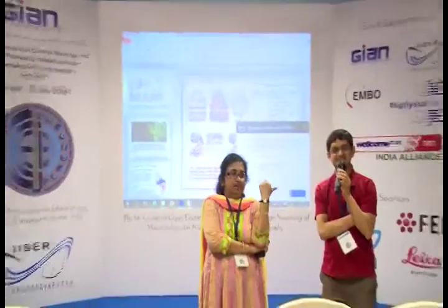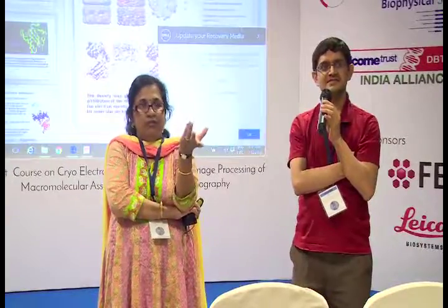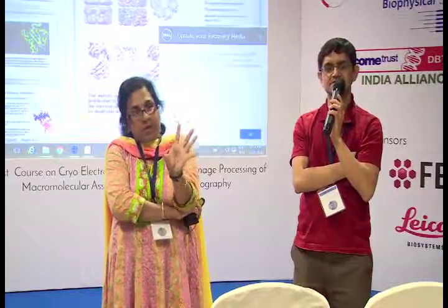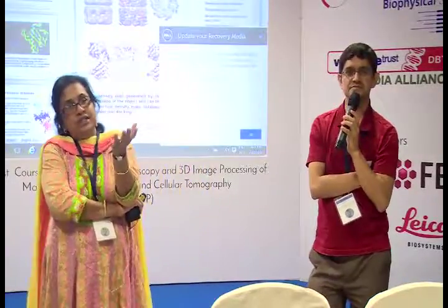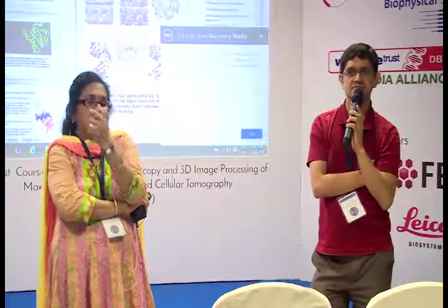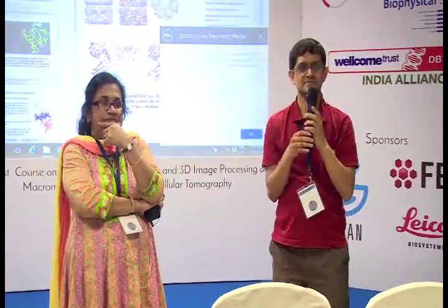Just to mention that molecular dynamics is trying to calculate the energy, but it's a Newtonian law you are applying. So it's not accurate, but it gives you some way to keep the stereochemistry and all those things. Ultimately, you are keeping the geometry fixed, but the way you are doing it is the MD simulation, which is trying to see the energy, which is not the correct energy, as we said. You have to do a quantum chemical approach.